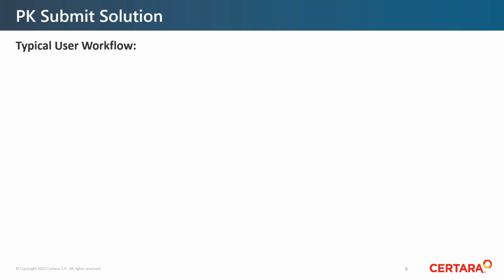Originally, PK Submit was designed to help the user automatically generate these CDISC domains and supporting documentation relevant to non-compartmental analysis. Those could be used for regulatory submissions, electronic submissions to regulatory agencies for the IND and NDA, right? But with the latest version of PK Submit, we've redesigned it. We're still delivering those CDISC domains and submission packages, but now we're focusing on the PK scientists and how they would prepare the data for their analysis to be able to generate those CDISC domains for submission. The key points with PK Submit are higher efficiency in NCA through automation, adding intuitive options that simplify the analysis process, as well as streamlining the process for regulatory submission.